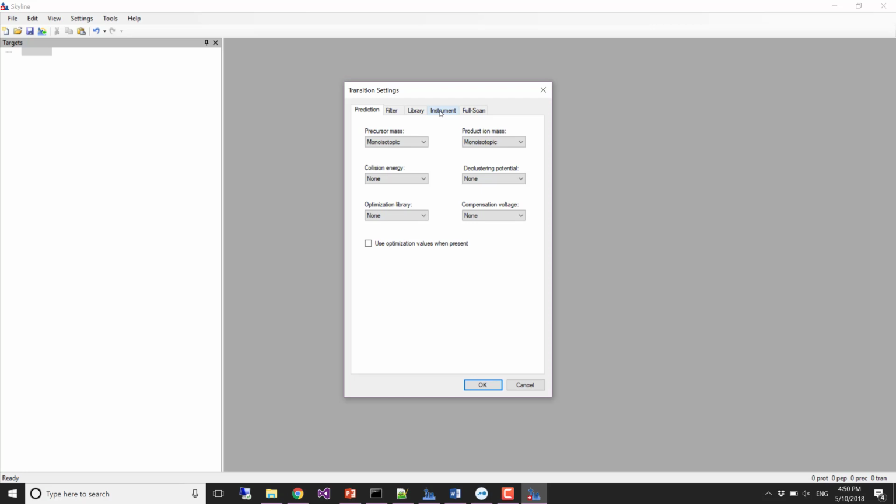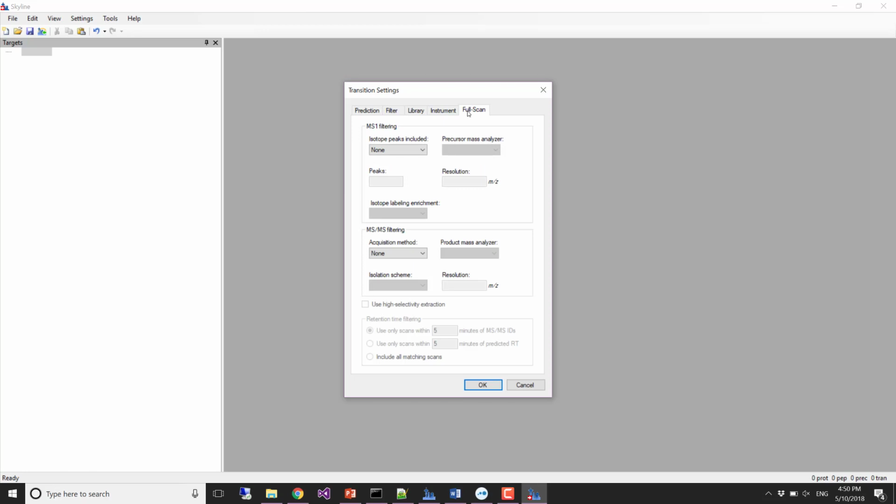Again, as I mentioned this morning, for those of you who are here, when I'm doing full scan, I'll just start with full scan and set up my full scan settings. We're not going to do MS1 extraction. We're just going to try to keep things small and fast. If we do MS1 extraction, it doubles the number of transitions we extract, and this is a big enough method already. But I still highly recommend using MS1 extraction, just not in this case because it's a pretty big set already. So let's go ahead and choose DIA.